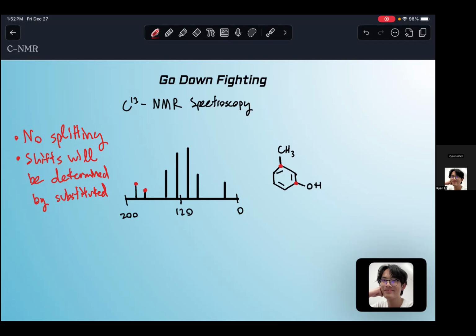Now, from there, we can go on to the next set of carbons that are the most substituted. And that's going to be the ones that are on the ring right here. I'm going to assign those to 1, 2, 3, 4. The last one is going to be this little carbon right here, and it's going to be assigned to here. So basically, as you can see, it's very, very easy to assign C13 NMR peaks just by substitution on its own.